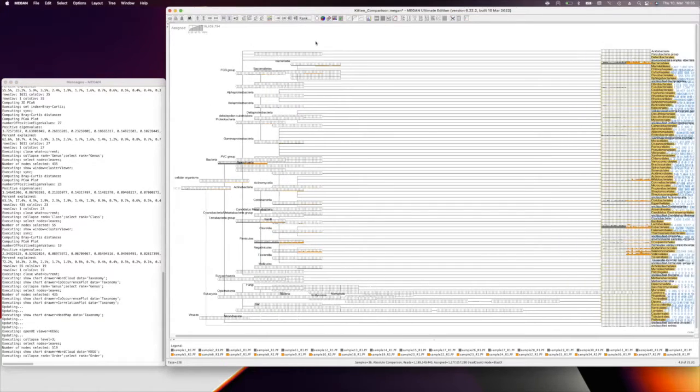in your main window. So whatever I do, for example, if I select a different taxonomic rank here, it will update this view, and then it will say what I've just done: execute, collapse, rank, order, select, rank, order.